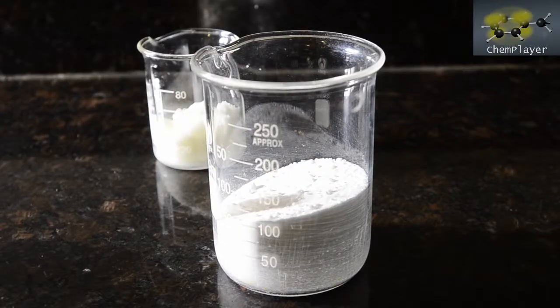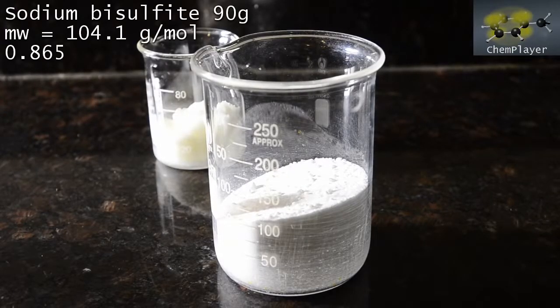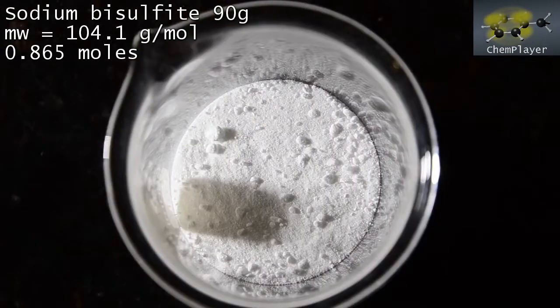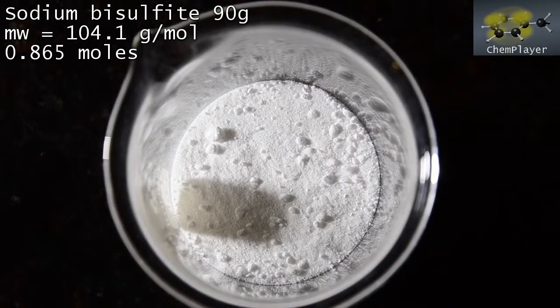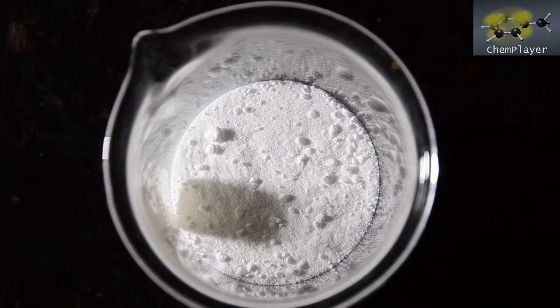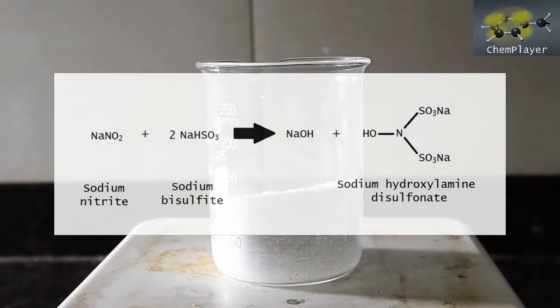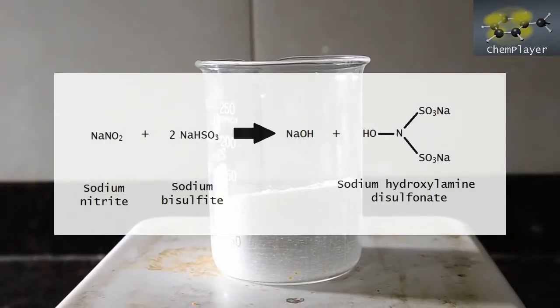And now here's 90 grams of sodium bisulfite. Again, this is used as a preservative and in home brewing, so it's quite readily obtainable. The theory is that the bisulfite can act as a reducing agent and convert the nitrite to a hydroxylamine salt. Let's give it a go.